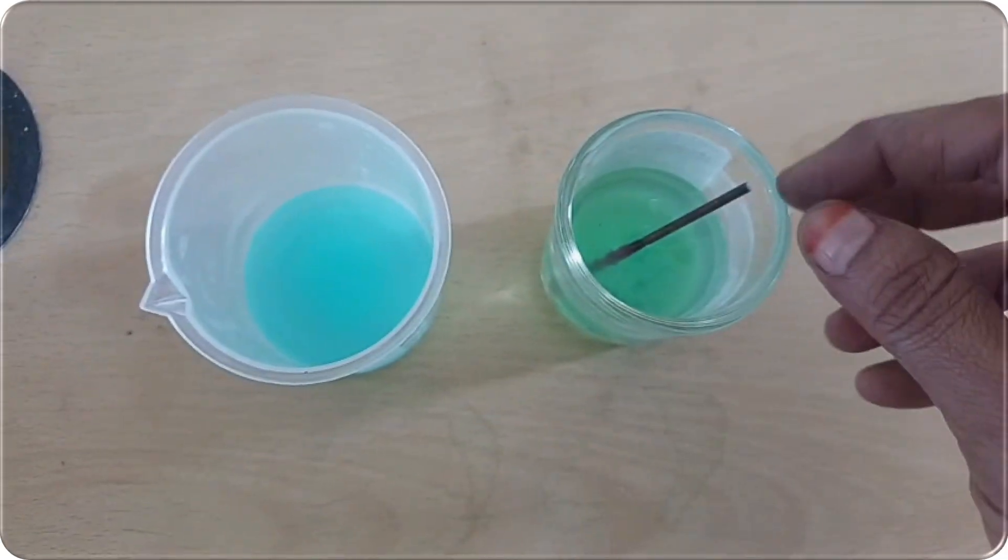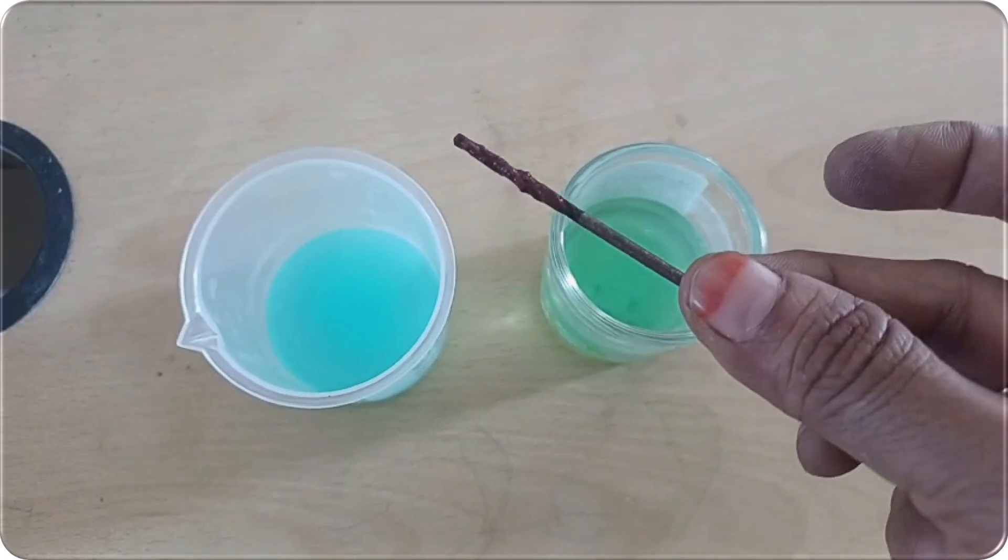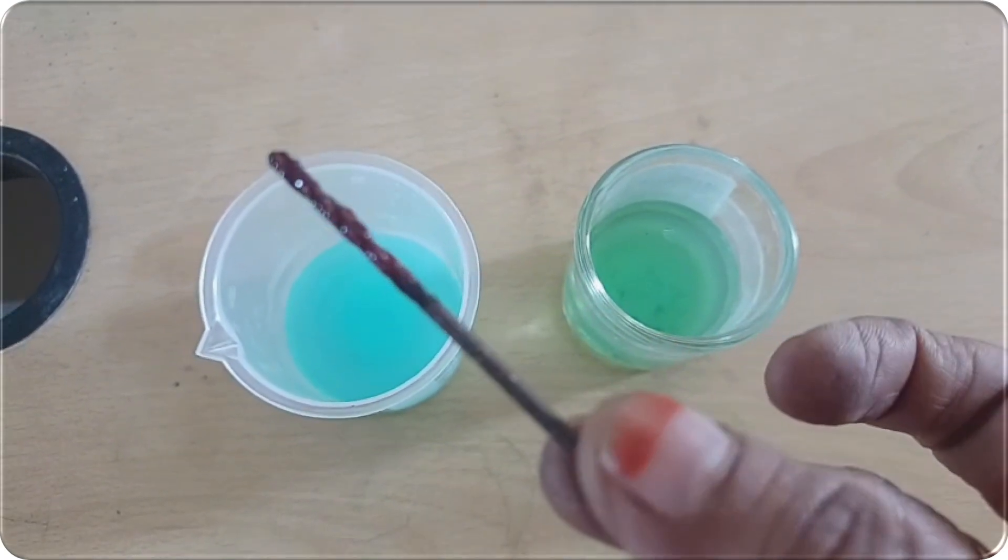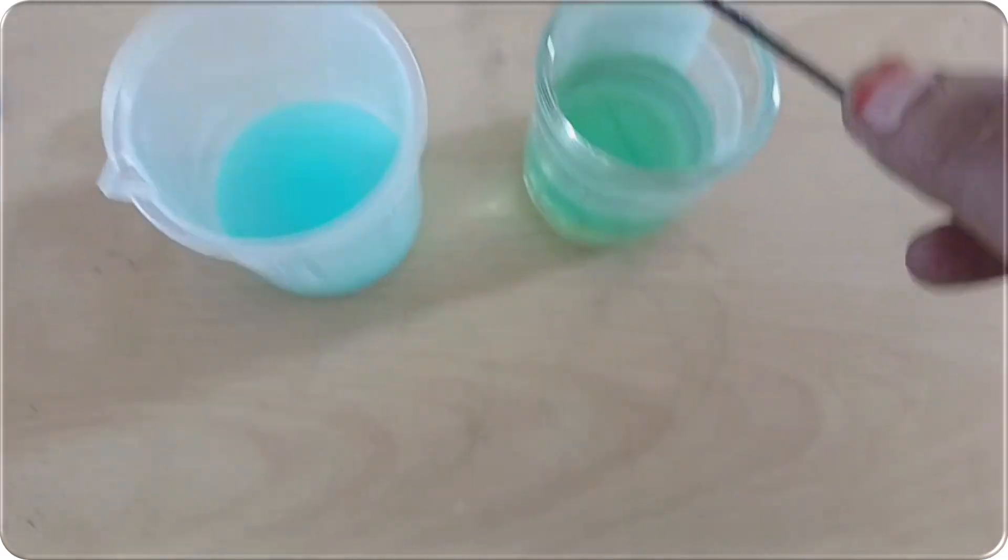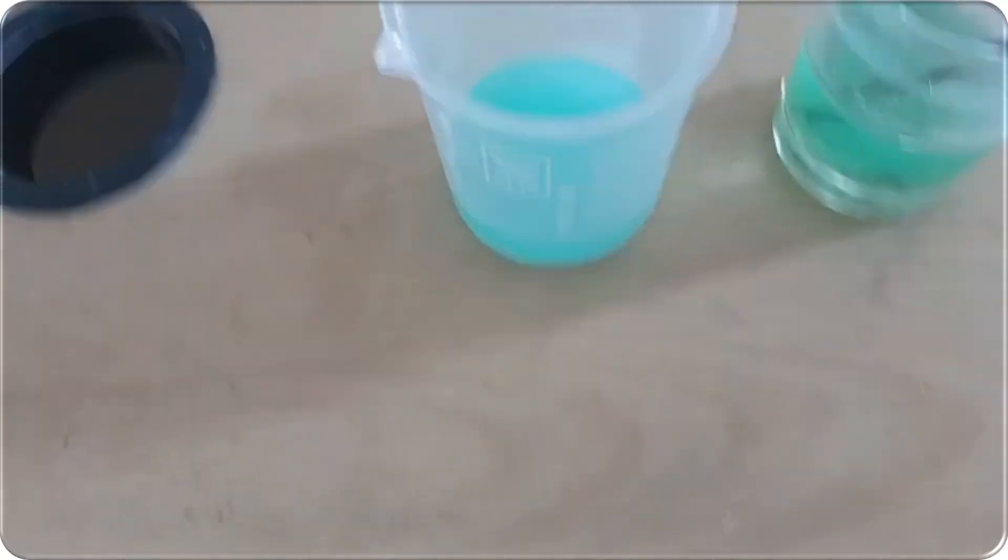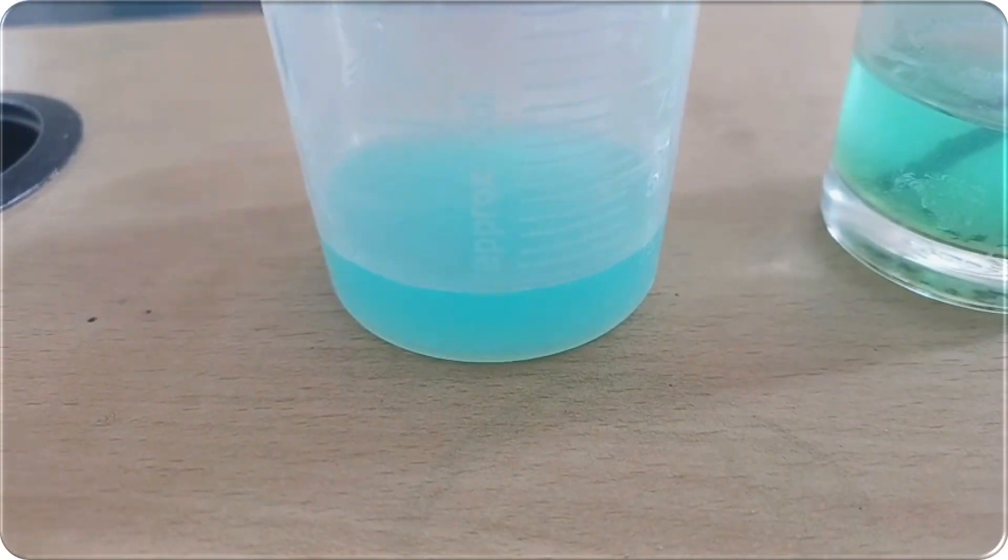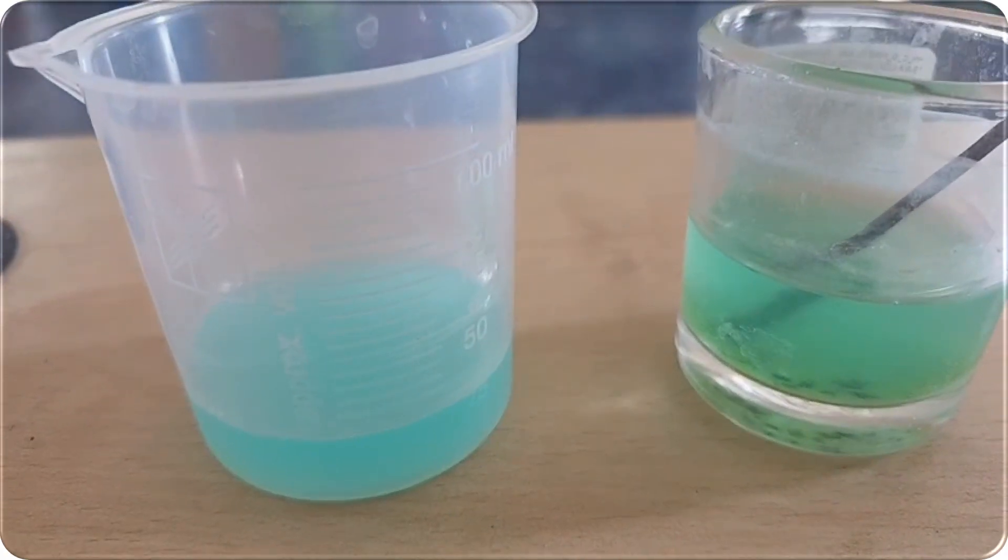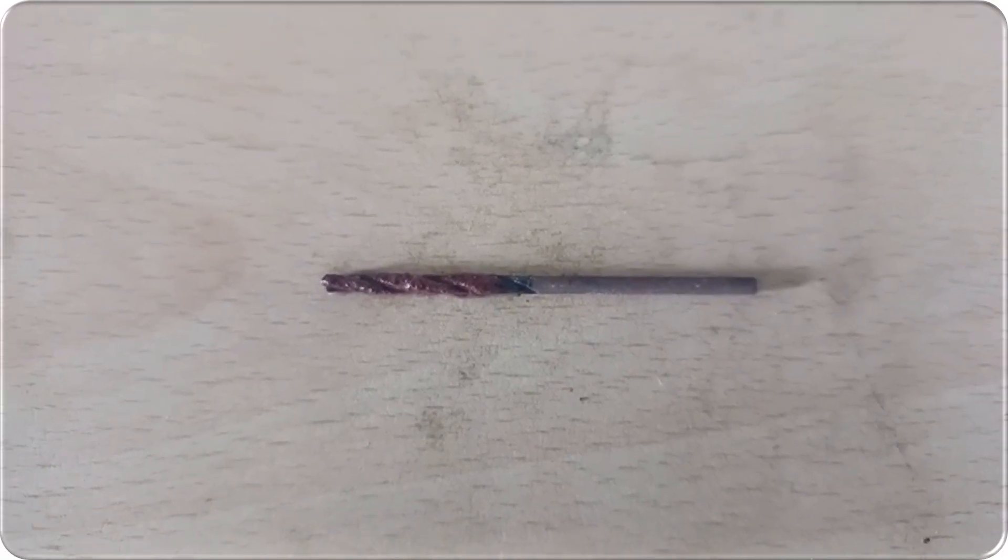Observe the color of the solution. The solution which we kept iron nail changes into green color because copper sulfate changes into iron sulfate and the copper has deposited under iron nail. The brown deposit on the iron nail is copper, a new substance.